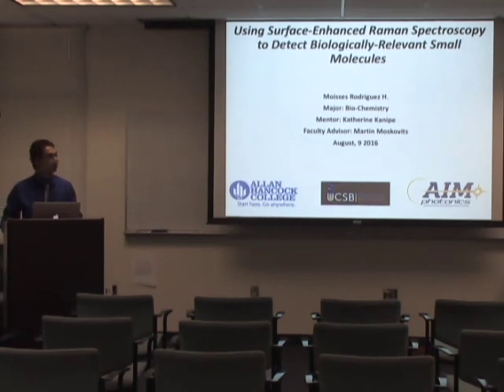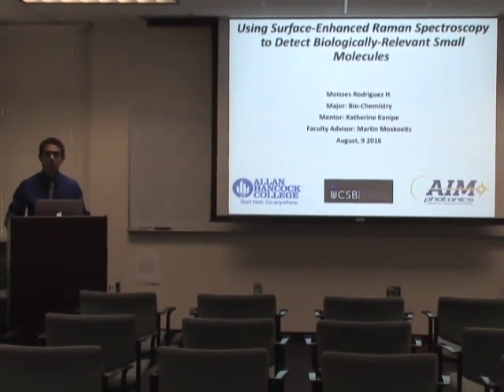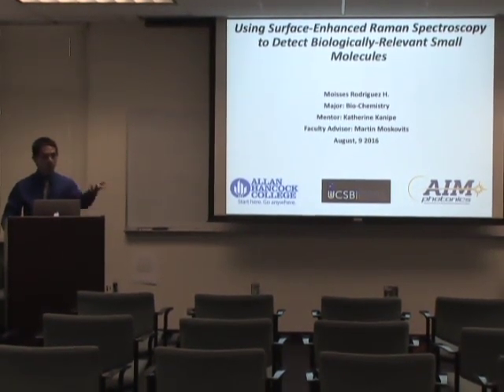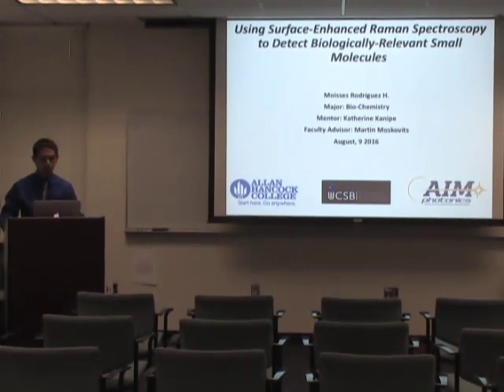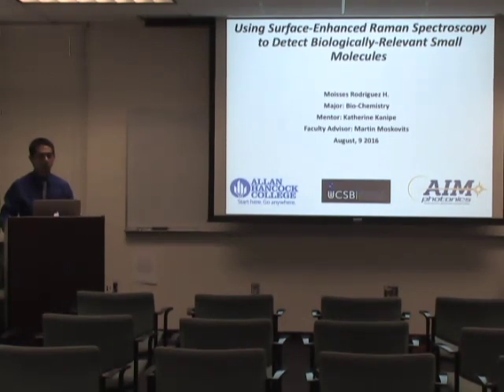Hi everybody, as you just heard, my name is Moises. I'm majoring in biochem. I am an analytical student. I'm transferring to Cal Poly in the fall. And I'm here with my mentor Catherine and my faculty advisor, who's not present today. And we're working to use surface enhanced Raman spectroscopy to detect relevant small molecules.